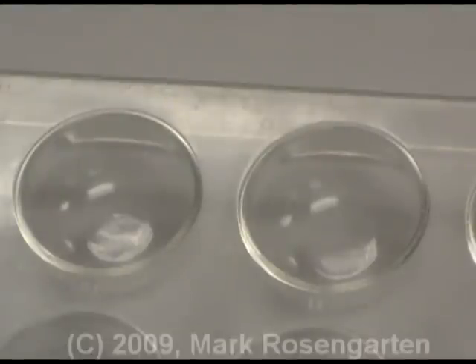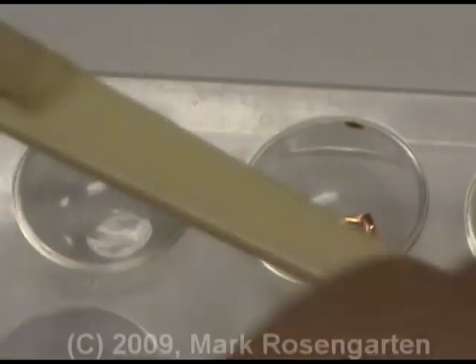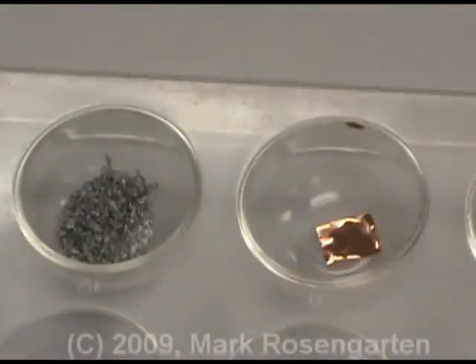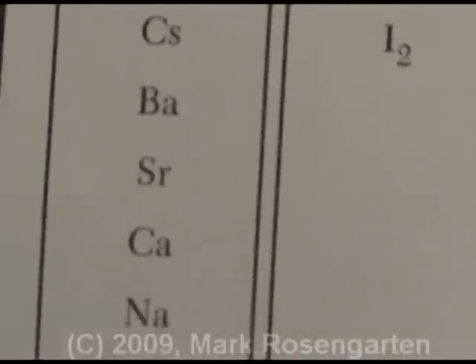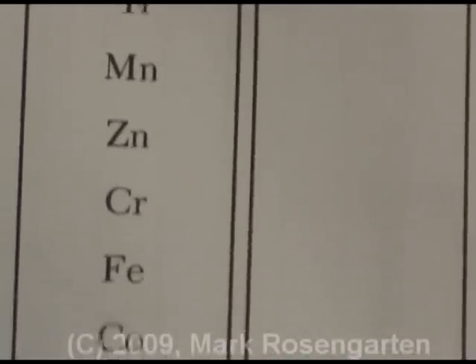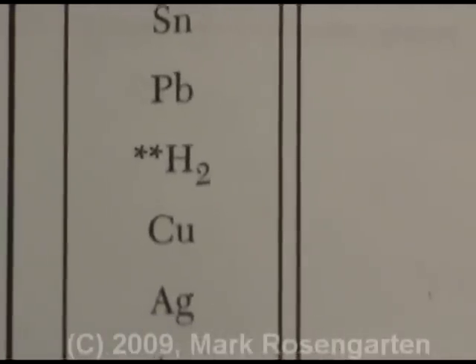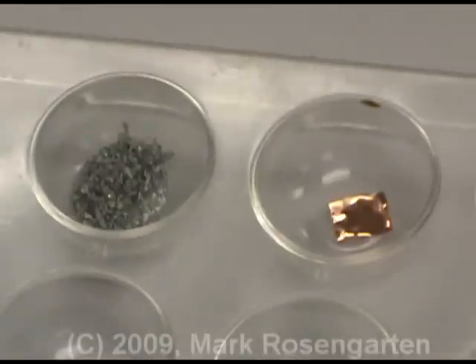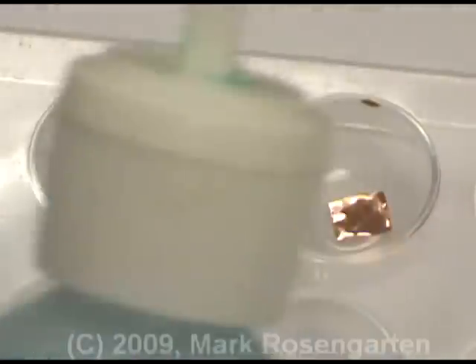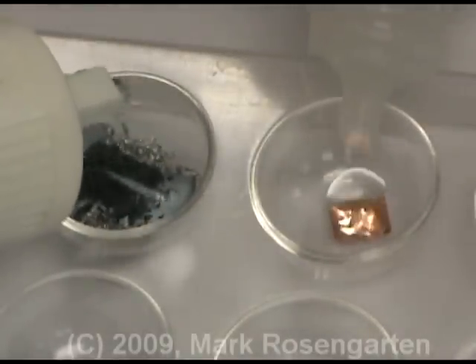This next reaction will test the relative reactivities of two metals: copper and zinc. According to reference table J, zinc is listed higher than copper, which means that zinc should be able to replace copper in a compound, but copper will not be able to replace zinc in a compound. Let's put that to the test — I'm going to put copper nitrate in with the zinc and zinc nitrate in with the copper to see which one has a reaction.